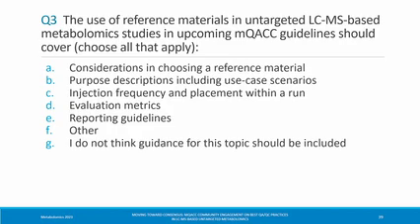Yes. To answer the question outright, if they are important, I would say yes. In my case, mostly for system suitability, just because I'm working with zebrafish, and getting reference materials in the form used in the study presented a bit ago is close to impossible. There are just no reference materials for those matrices. That's why it's mostly just system suitability with general reference materials. Yeah, absolutely. Okay, thank you.